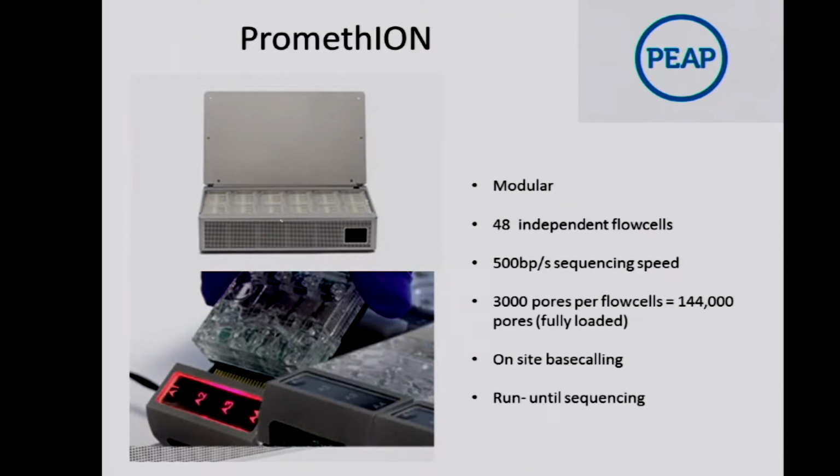This supports on-site base calling. Right now, the MinION is on cloud-based calling, so you have to have an internet connection to do base calling, which is significant for some of the applications we'll talk about later.